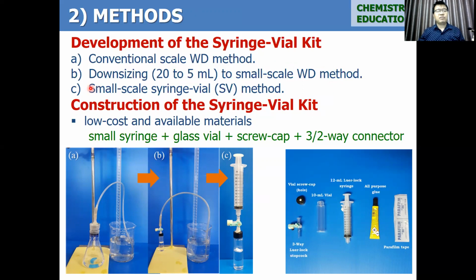And finally, we use the small scale reaction, but this time we use the syringe-vial kit as the gas measurement method.